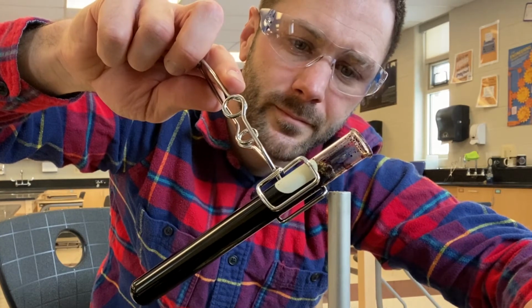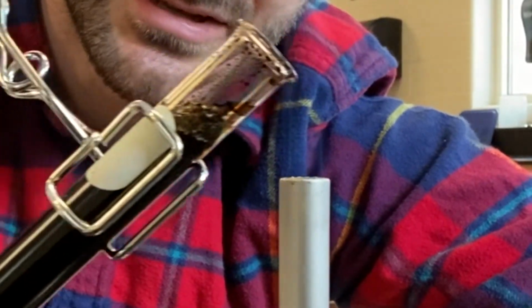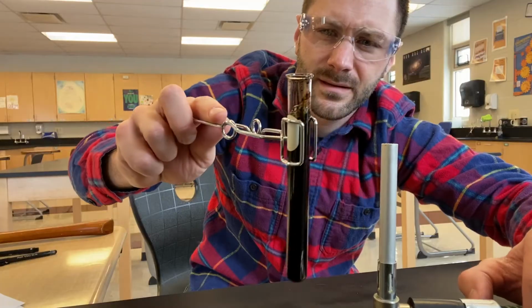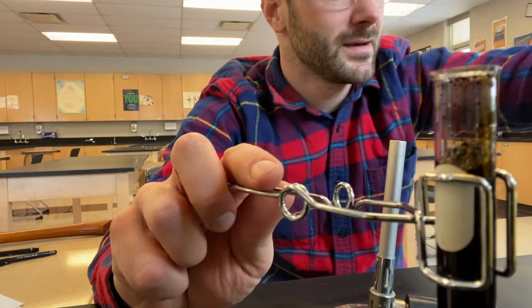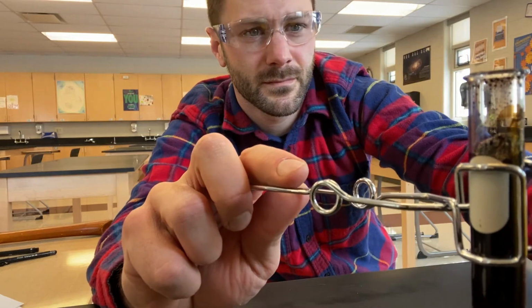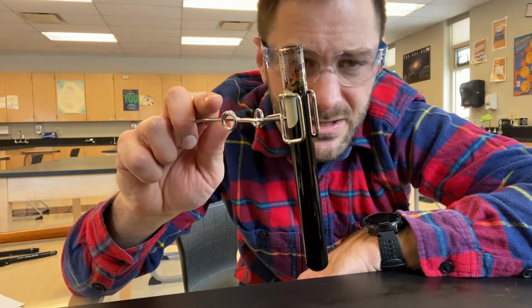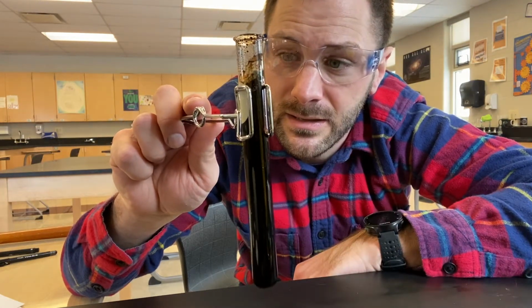Okay, now, the goal of this lab is to not only determine when a physical change has happened, as opposed to when a chemical change has happened. Look at that little flame on the top of the test tube. I'm going to shut off my Bunsen burner so I can get that out of the way. If you're thinking that perhaps a chemical change has finally occurred, you're thinking in the right direction. The question is, why are you thinking that way? What evidence have you gathered at this point to reach that conclusion?